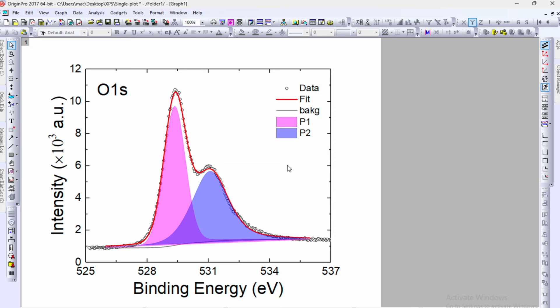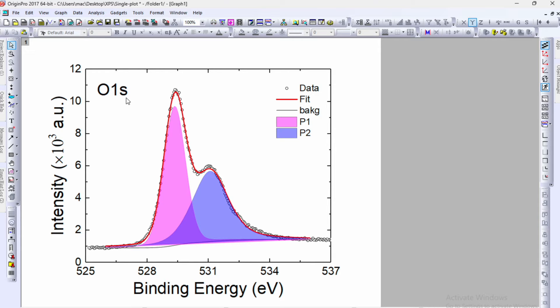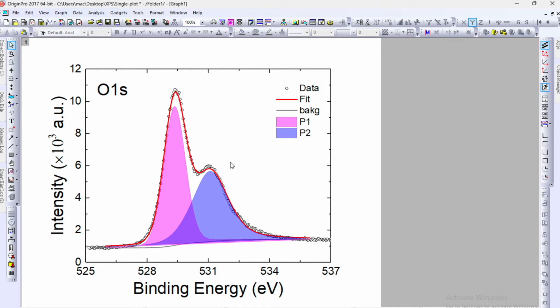I will show you how to calculate area under a curve using Origin software. Let's consider an example. This is an XPS spectra of oxygen 1s. After deconvolution I found there are two peaks within one XPS spectra. Now I want to get the area of each peak or the contribution coming from each peak under total oxygen XPS spectra.